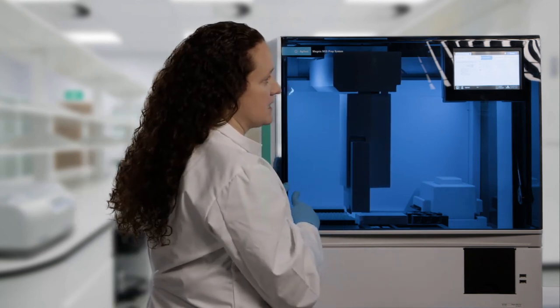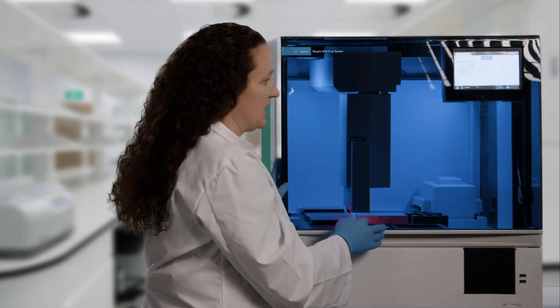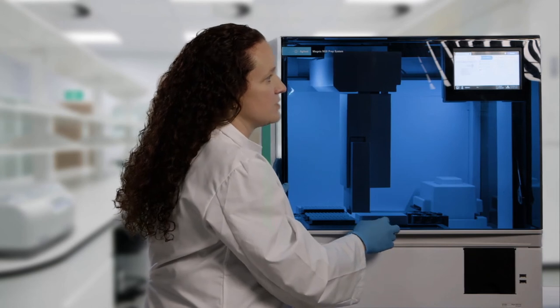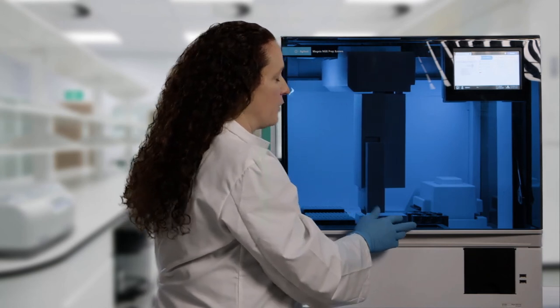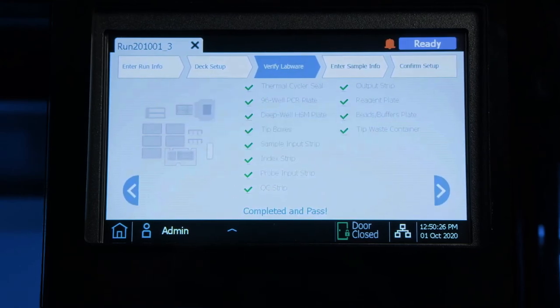Once it finishes the tip boxes, it will move on to the sample input strip, the index strip, the probe strip, the QC strip, as well as the output strip. It will then scan into the chiller module to scan all of our PCR strips.